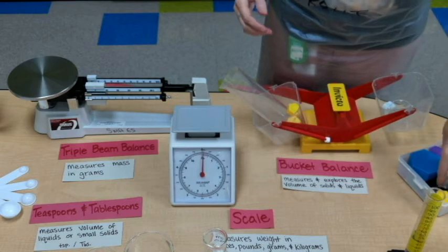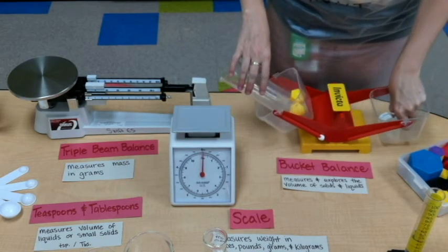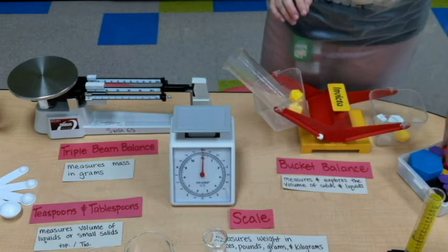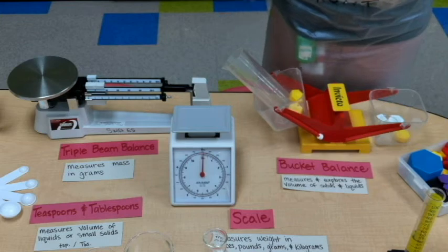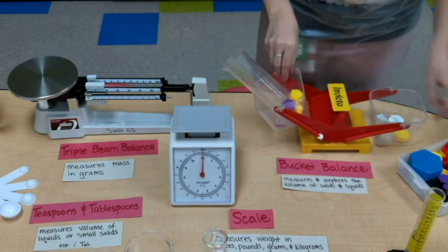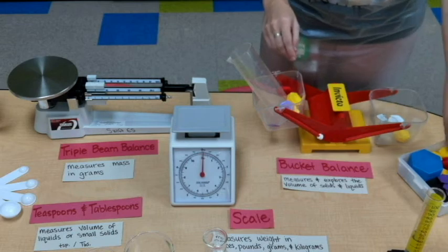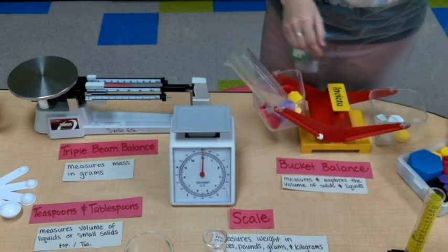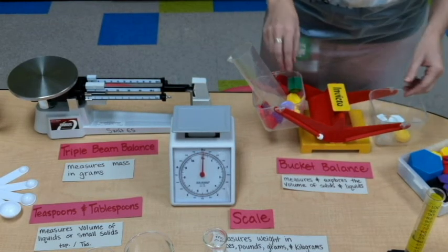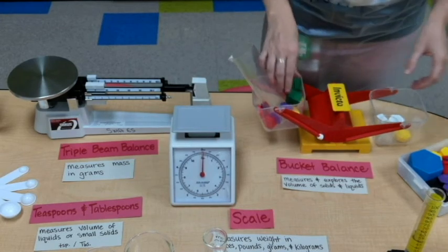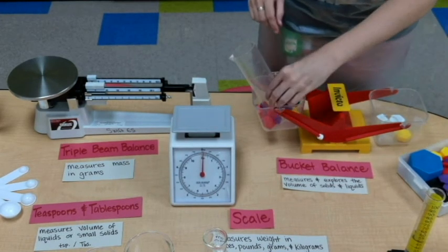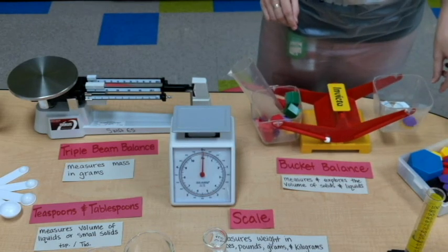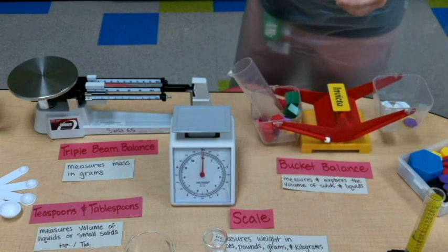And with the bucket balance, it's not necessarily accurate readings, unless you're using something like gram stackers. But with the younger kiddos, they're just trying to see visually what has more weight to it. If I keep adding on one side, is the balance eventually going to topple over? Am I going to add enough things, enough items, to one side that will eventually move the scale back and forth?